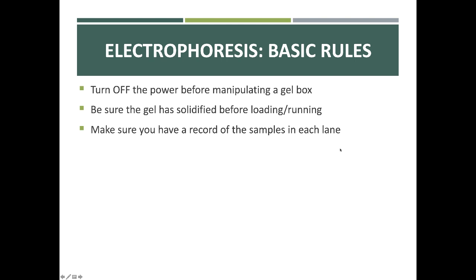This is an important step too. If you don't remember the order that you put your samples in, it makes it hard. Having a really well-organized lab notebook is very important. The simulation that you will run today actually has you do that before you can actually proceed.